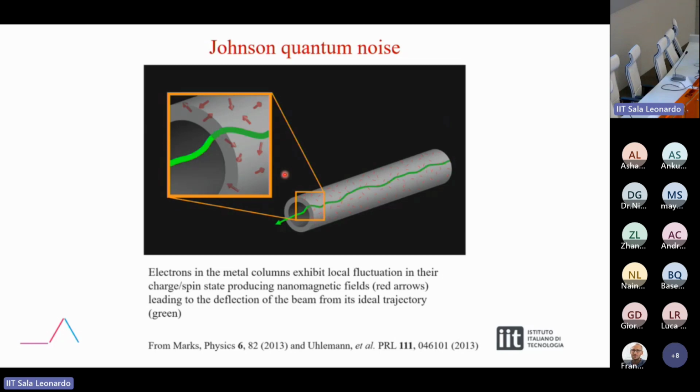No, because in an electron microscope you have the column. So for example, here you have a circular beam, right? You don't have a single electron. Some electrons will travel close to the electron column, and some will travel far from the column, closer to the optic axis. And you have the lenses, the objective lens, aberration correctors, condenser lenses. So you have metallic components in your microscope that affect the trajectory of the beam.